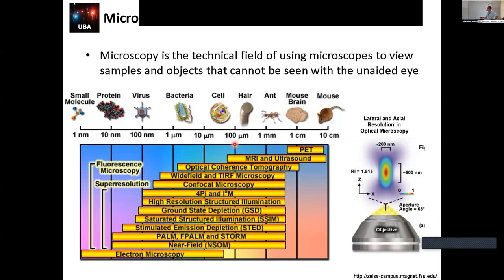because we can cover certainly a great range of different scales in terms of sizes. So we can go from millimeters to centimeters in some of the mesoscope microscopes that we have today, to the level of the single molecule, to a few nanometers nowadays. To achieve that goal, we have a really long list of different approaches that we will cover, most of them across the workshop.